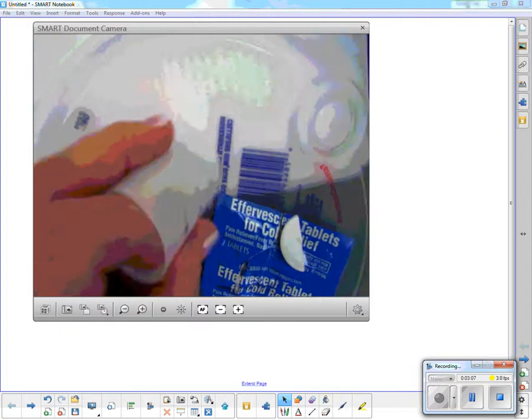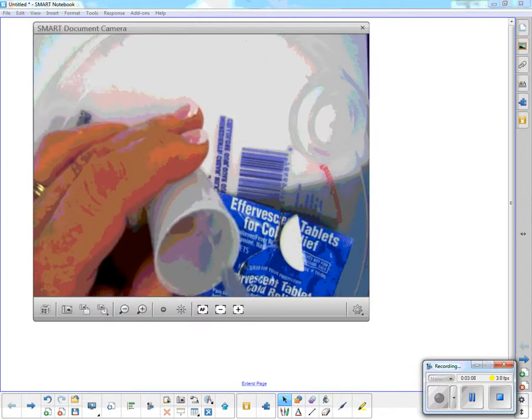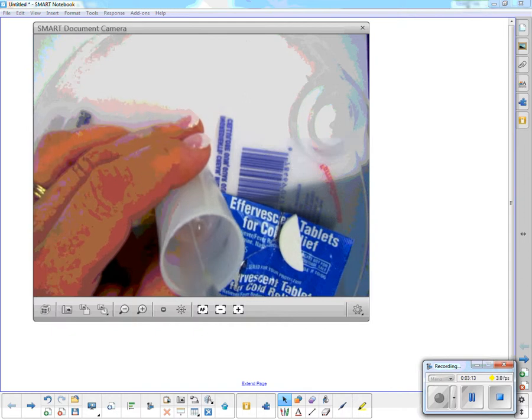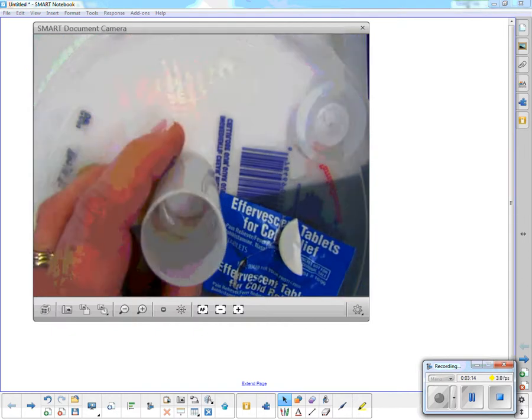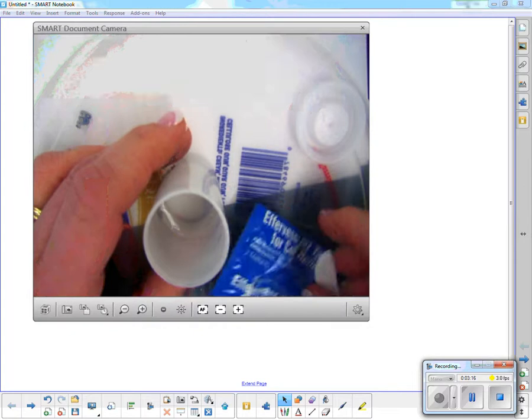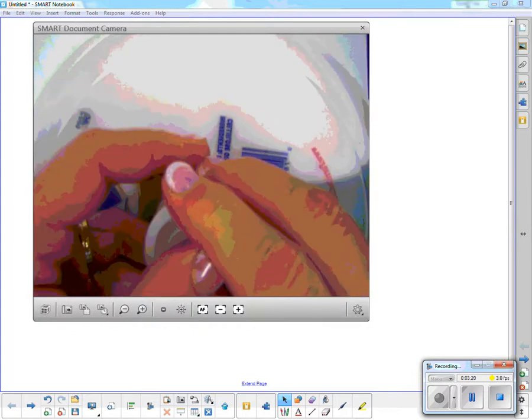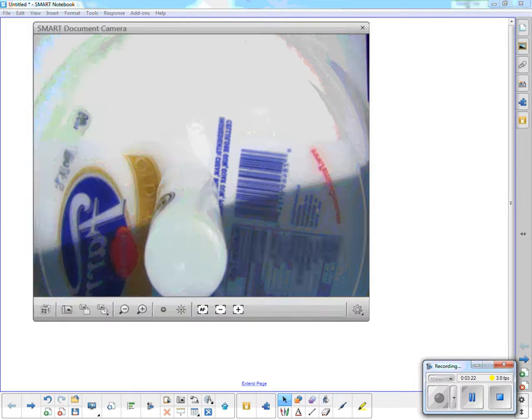So what you're going to do here is you're going to fill it up, and you're going to actually do this one outside. So this one would actually work for all. You could vary the concentration, you could vary the reaction temperature, you could do a whole bunch of things. So I'm going to put a whole tablet in, turn it upside down, and back away.